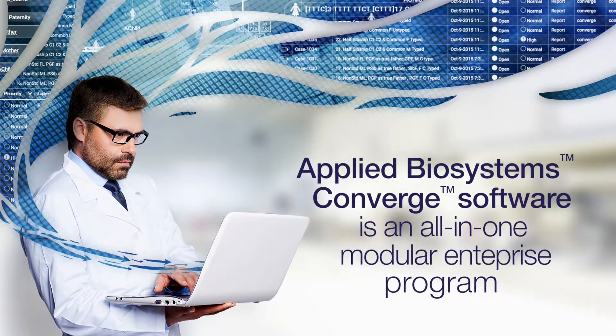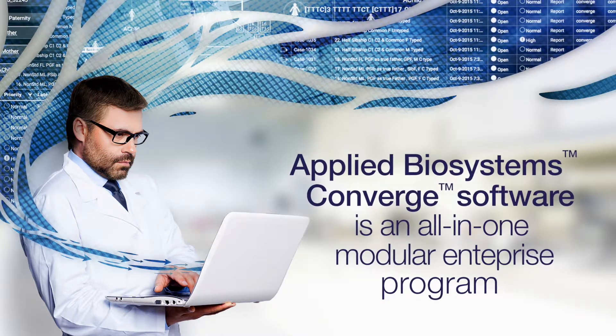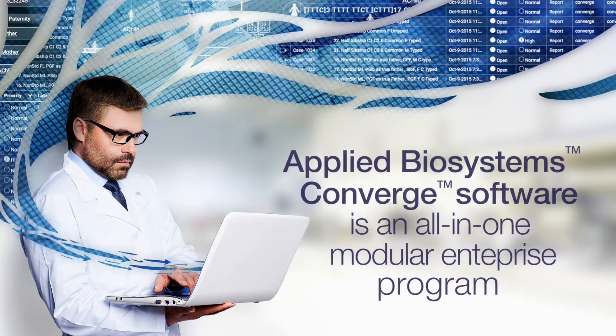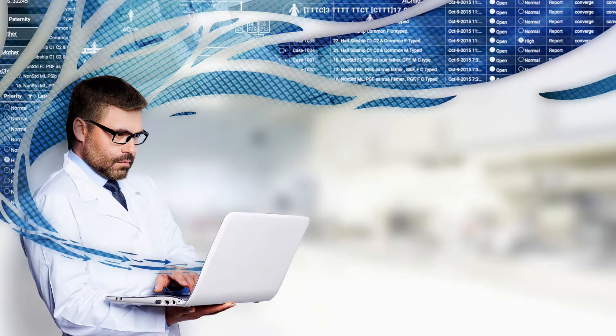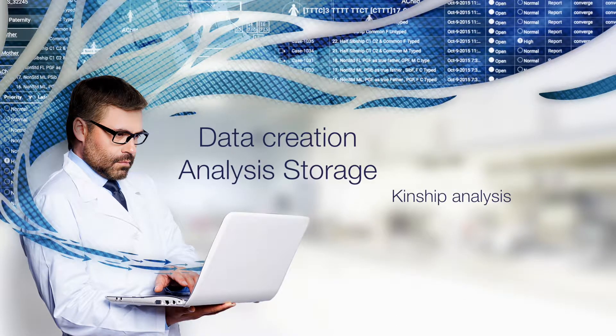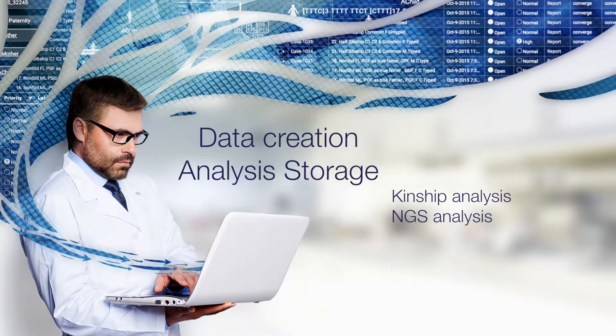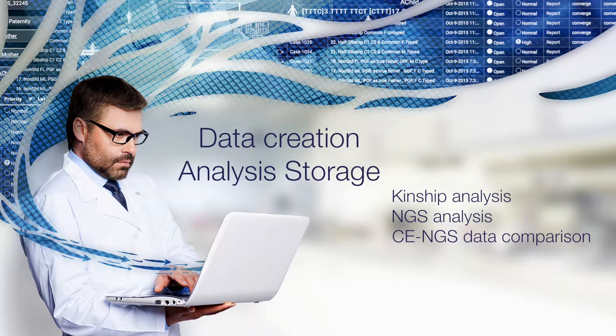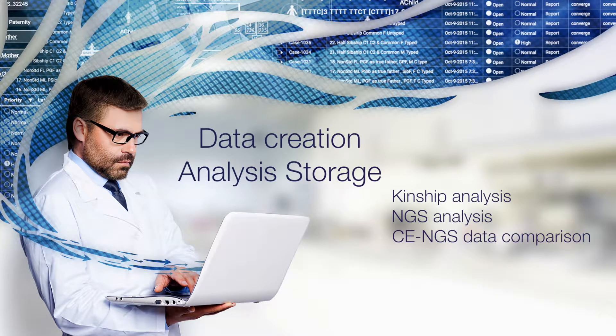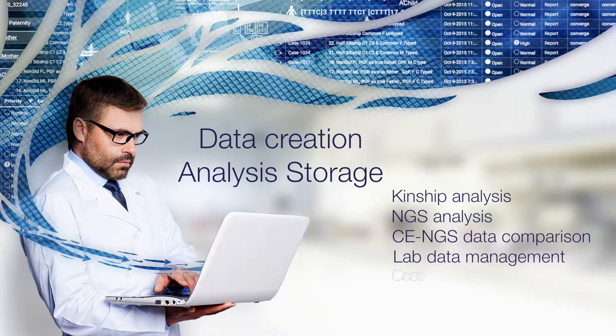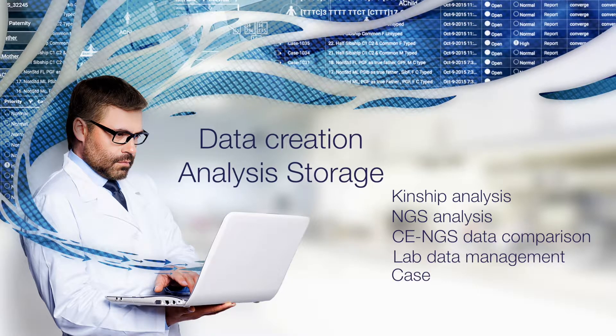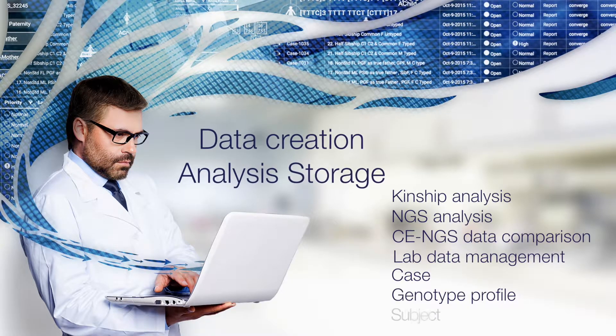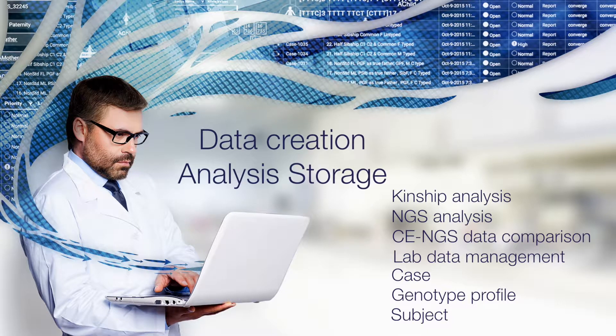Applied Biosystems Converge Software, an all-in-one modular enterprise platform, supports paternity and kinship analysis, NGS analysis, and CE to NGS comparisons of STR profiles, and laboratory data and case management, enabling automated data transfer and integration with various forensic DNA laboratory systems.